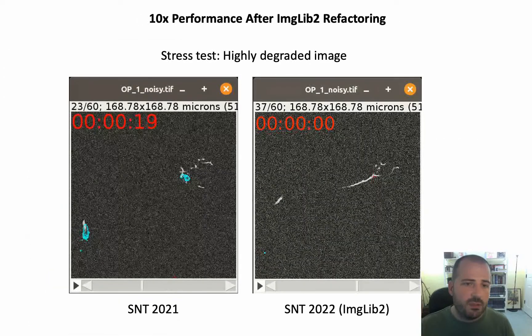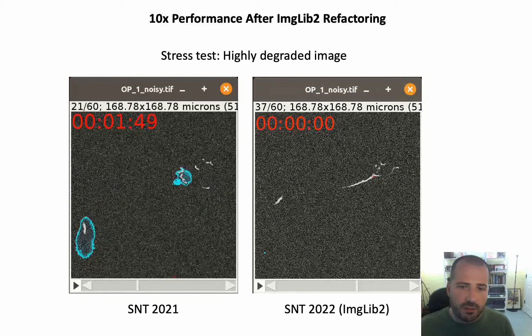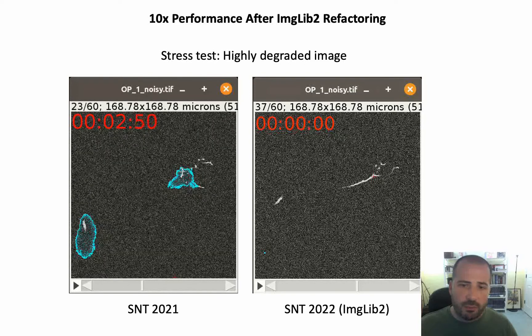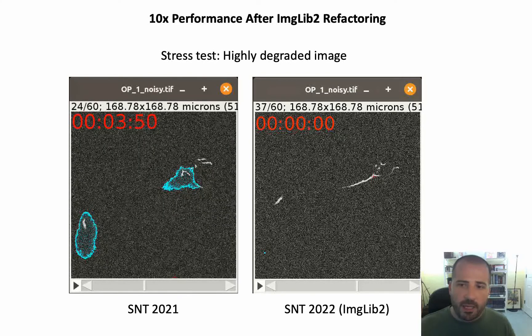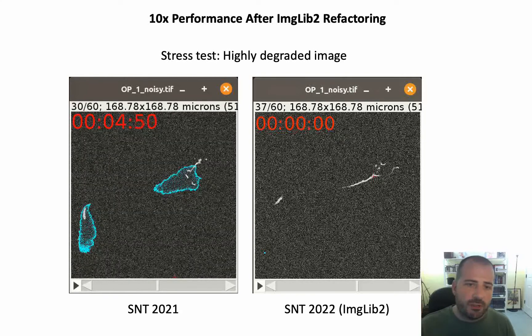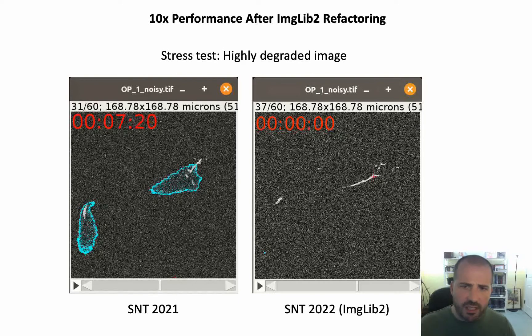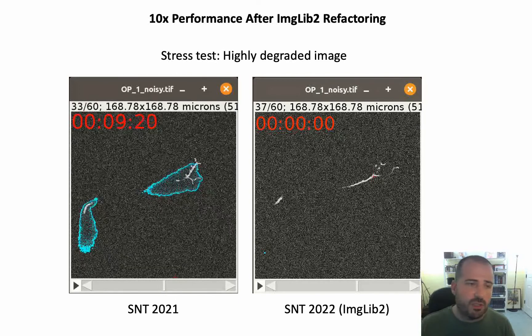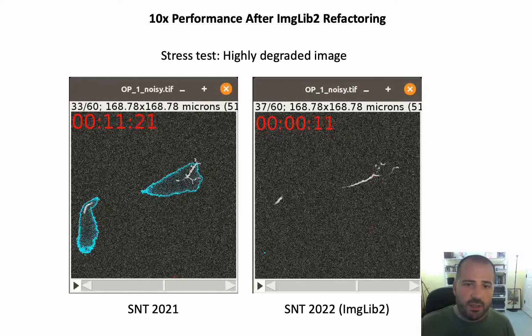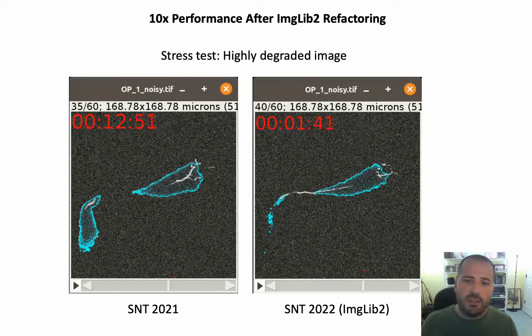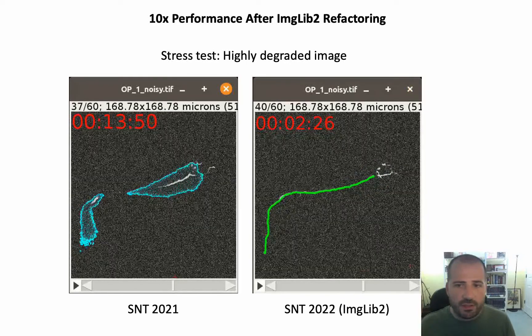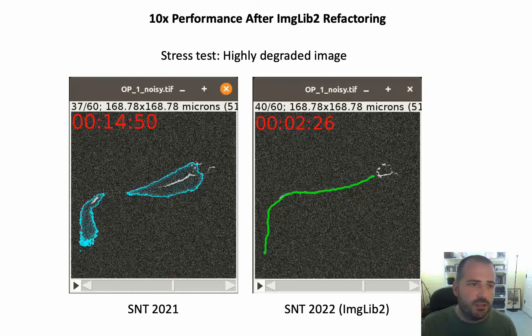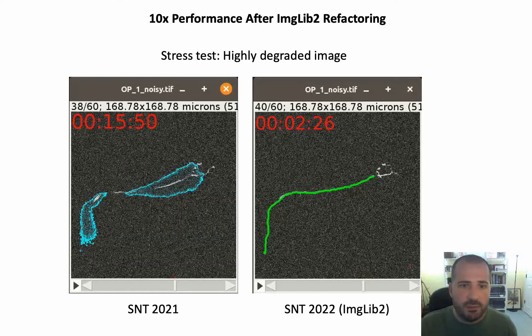As an example, I am showing you here a highly degraded image. On the left, you are looking at the published version of SNT, and you can see that the bi-directional A* search is having a hard time converging into a result — the whole process will take more than 20 minutes. On the right side, however, you have the same algorithm now running under ImageJ2 data structures, and the entire task completes in just two minutes, which is a significant performance boost.